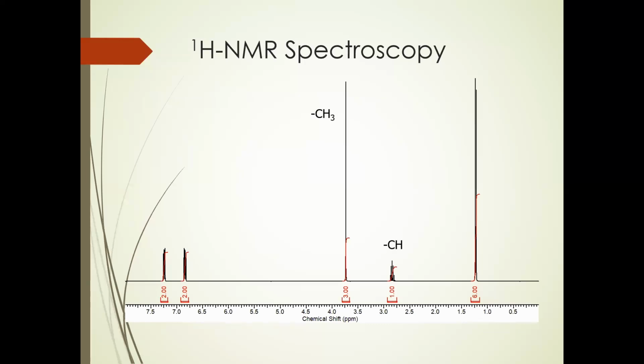And when we do that, we can see that we have a CH3. So that group that we identified earlier is methoxy or alkoxy, the OCH3, or OCH initially. Now we know OCH3. And we know this can't be one of the halogens. It can't be chlorine or bromine, or this would be a molecule unto itself. There's no bonds left for anything else.